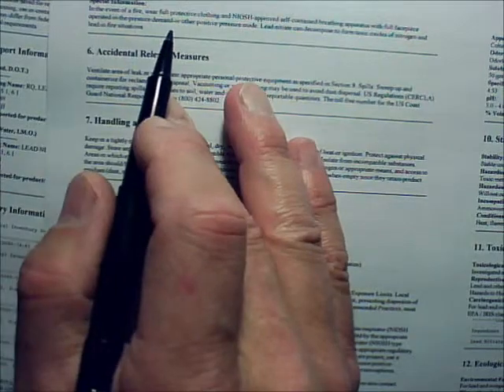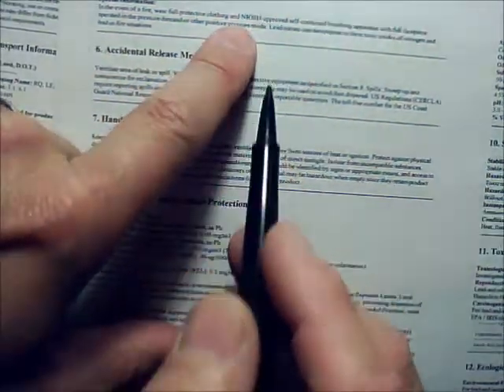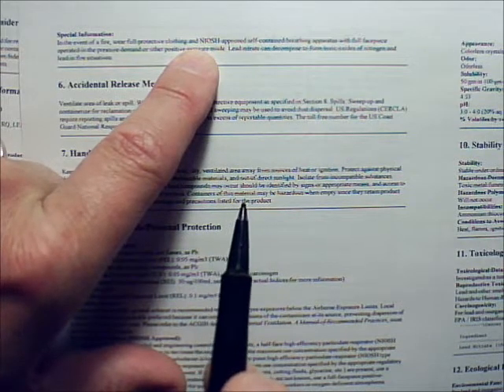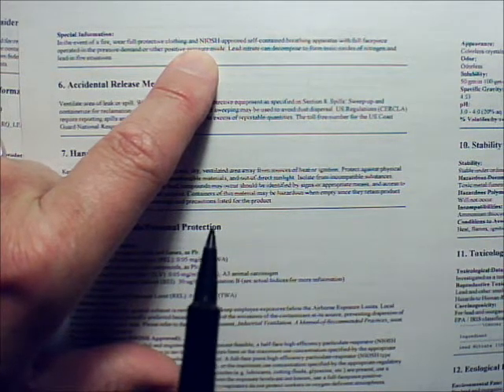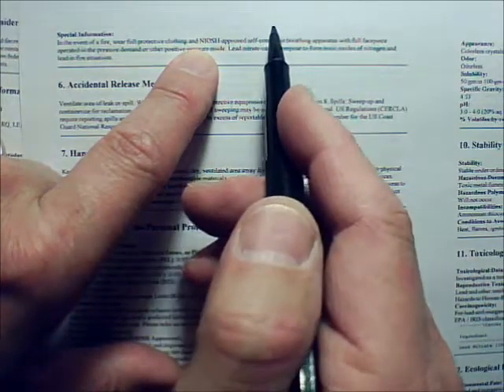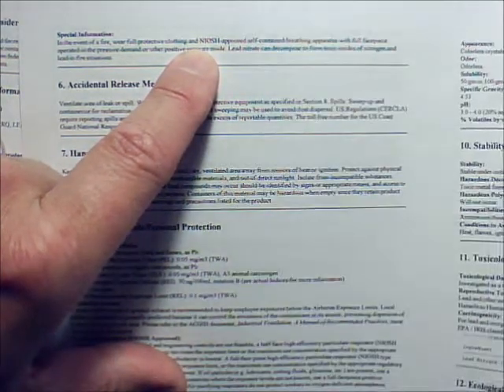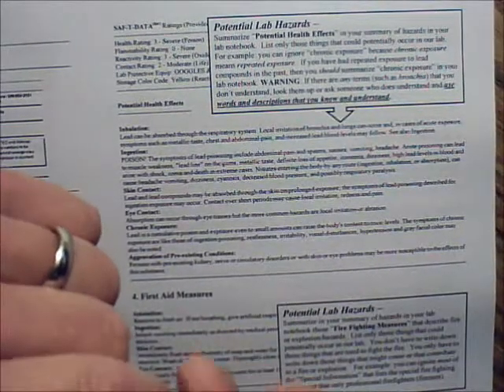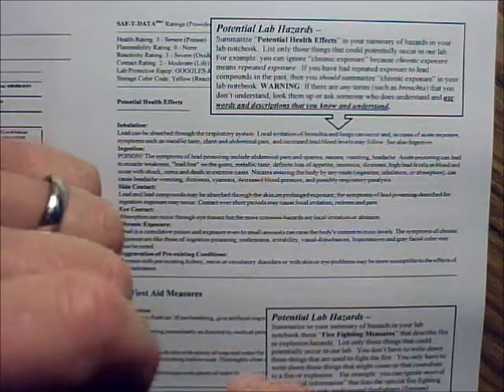Wow. So there's a fire? Well, what I'm getting to is, does anybody here have any NIOSH approved self-contained breathing apparatus? That's firefighting equipment. We don't have that. You don't need this. If there's a fire, what are you going to do? Stop, drop, and roll. No, you're going to get out of the building. Stop, drop, and roll, well, only if you're on fire. Okay. But what about somebody else on fire?